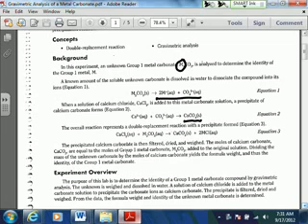Now, the other thing that we know is that calcium carbonate is insoluble in water. It will actually precipitate, okay? So what we can do is we can put this into a solution of calcium chloride, or we can add the calcium chloride to the metal carbonate, and the calcium carbonate is going to precipitate, okay?